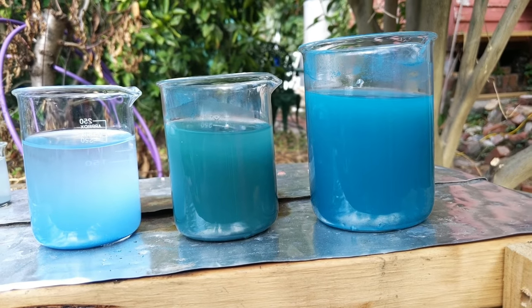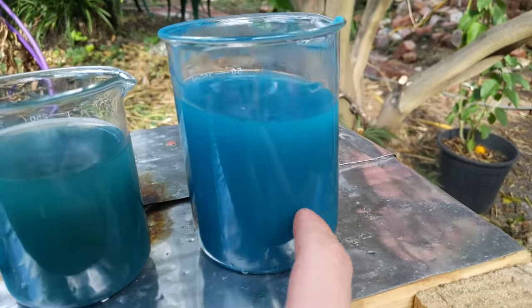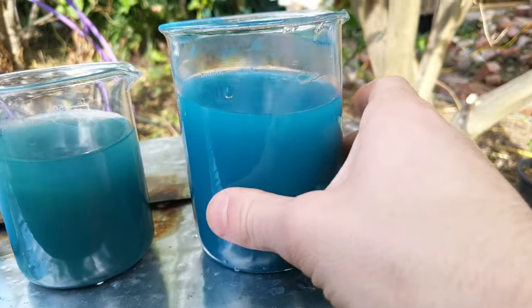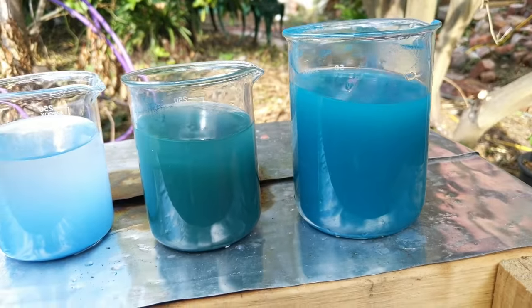All right, so we got three colours and I think this one here is the one — the one that I've been after — and I'm super proud and super happy with that. We'll get this all dried up, cleaned up, and filtered, and then we'll check them out.